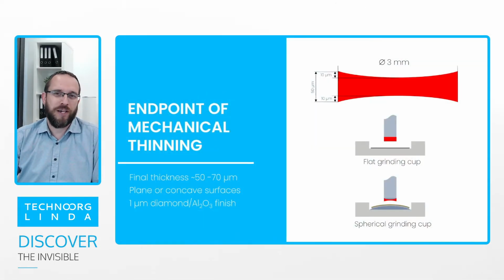Yeah, thank you for the addition. As Anders told you, these devices are really optimized for the 3 millimeter discs, which are used in the TEM sample preparation. I should mention one more thing about micropole, the polishing machine.